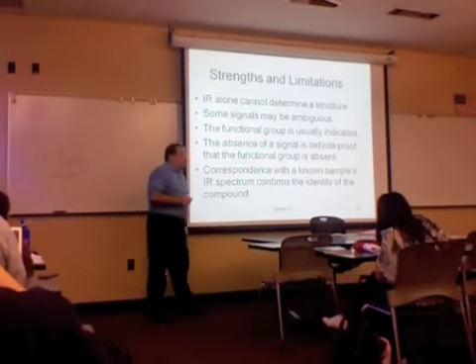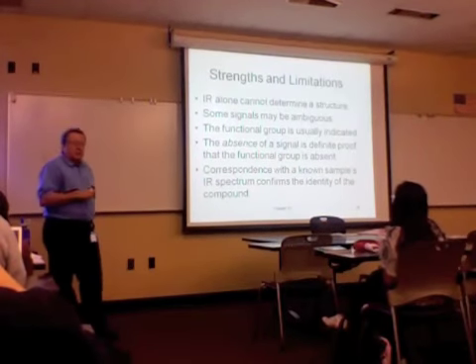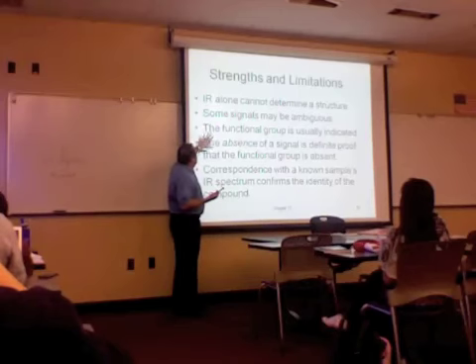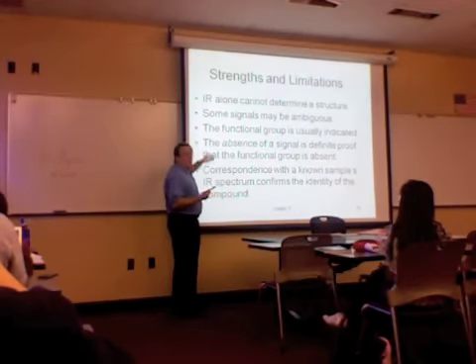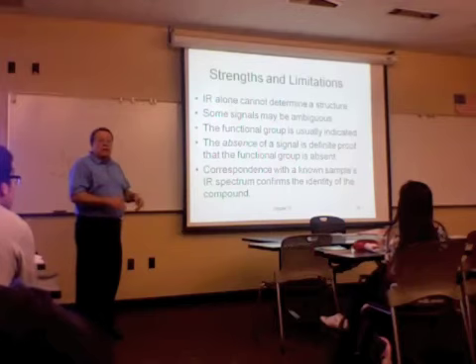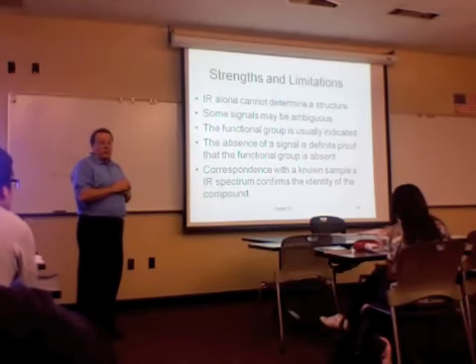However, functional groups are usually identified with the infrared, and the absence of functional groups is identified. In other words, if I've got a big OH stretch, it says I've got an alcohol. If there isn't a big OH stretch, what does it say? You don't have an alcohol. And so this can, in fairly unambiguous fashion, eliminate or suggest the presence of important functional groups.